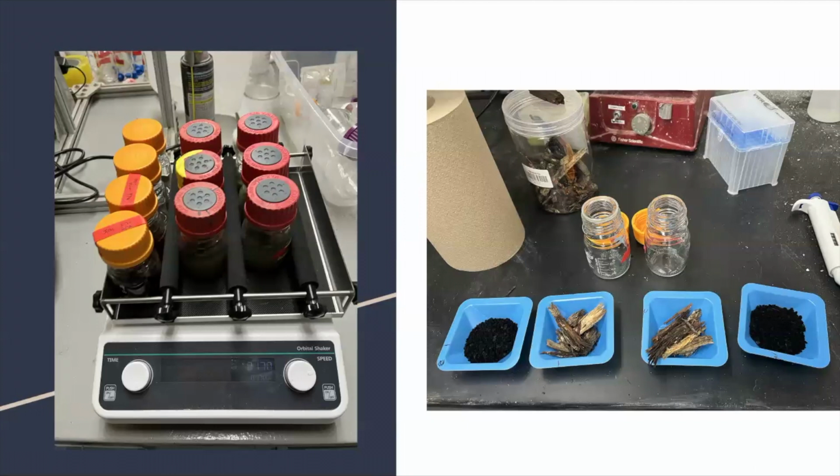The mulch was torn up into smaller pieces, about 0.5 inch strands, to mitigate potential clogging, and the mulch and GAC groups were put into the red dye containers. The contents were placed on a shaker at 170 RPM for 48 hours.